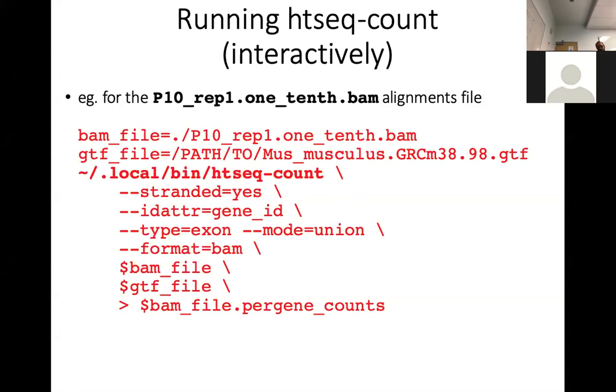I can just try to make it work for everyone. I don't think it's going to work. Yeah, I don't think it's going to work. Just try to copy the program anywhere.